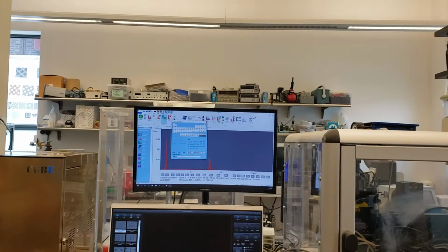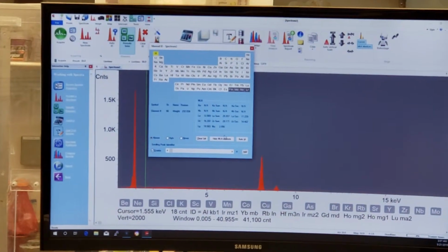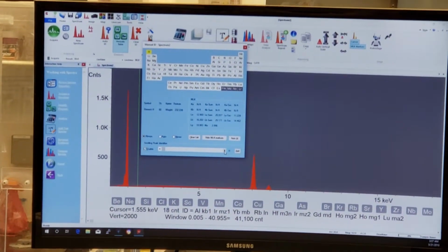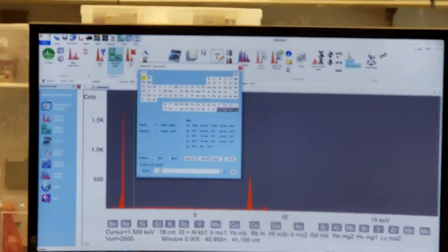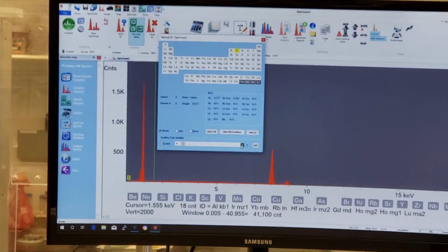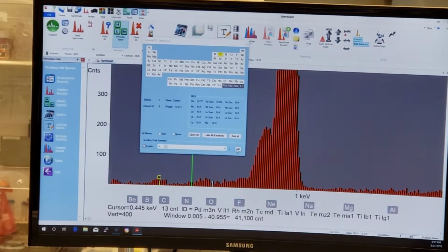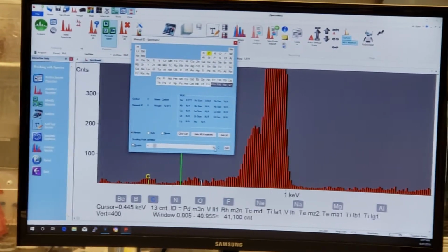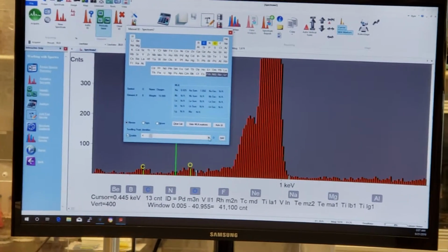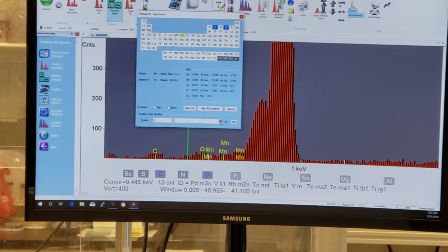Here, see where it says enable scroll peak identifier? If I select that, and I start at the first element, which is hydrogen, and work my way all the way to the right, see as I keep moving to the right, it keeps lighting up elements, right? They go to boron, carbon, and if I open up my spectro peak, I do have some carbon, so I can go add, and I can just keep going to the right, oxygen, add, keep going to the right, keep going.